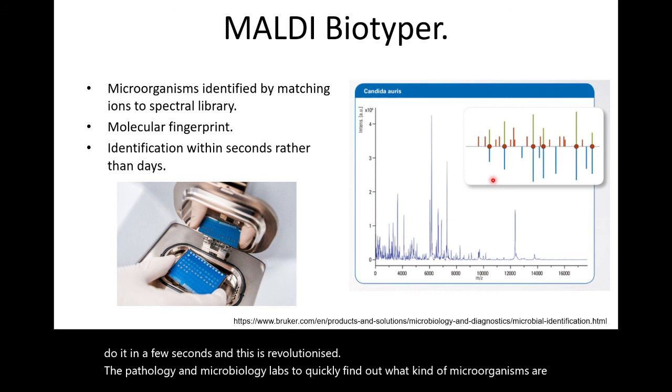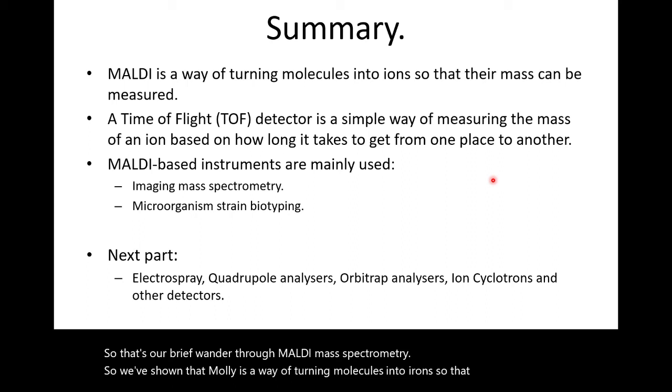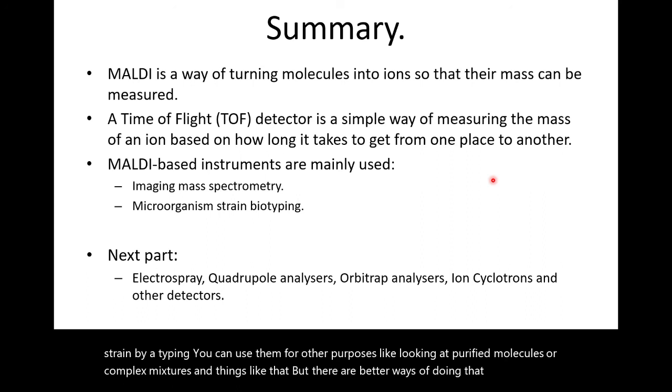So that's our brief wander through MALDI mass spectrometry. So we've shown that MALDI is a way of turning molecules into ions so that their mass can be measured, typically by time of flight. And nowadays, those MALDI-based instruments are mainly used to do imaging and also to do strain biotyping. You can use them for other purposes, like looking at purified molecules or complex mixtures and things like that. But there are better ways of doing that, especially using electrospray and liquid chromatography.